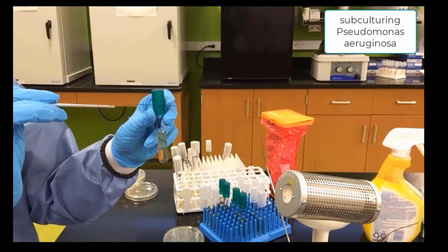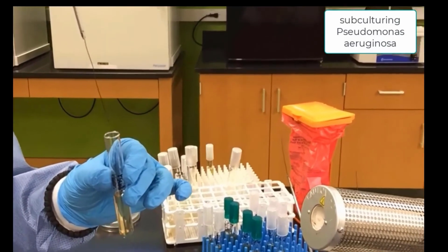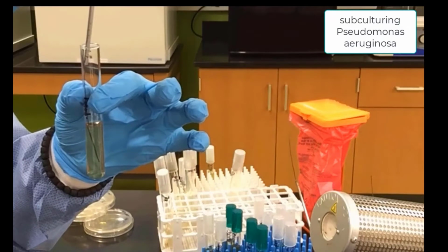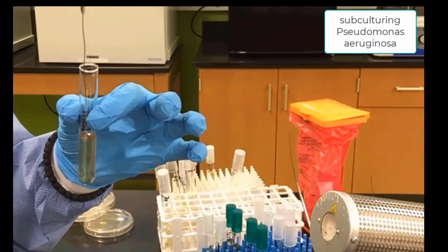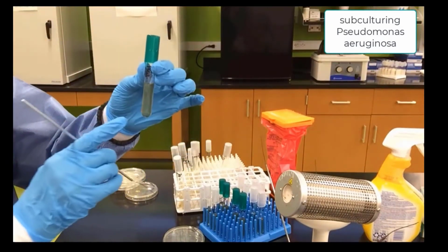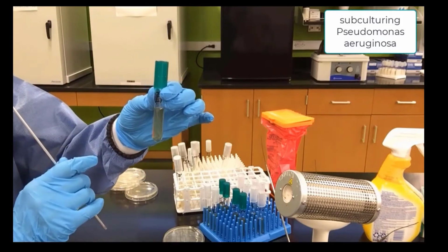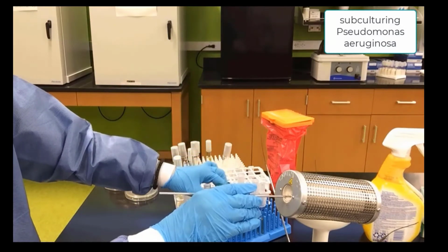We pick up our sterile gelatin. We uncap it. And then we go in and stab in the center of the gelatin about 3/4 of the way down. We don't want to go all the way down. We don't want to introduce air into the bottom of the test tube. We want bacteria that grow on the bottom with a little bit of oxygen to be able to use their gelatinase and metabolize gelatin if they have gelatinase, and the ones on the top that use oxygen to be able to metabolize gelatin as well.